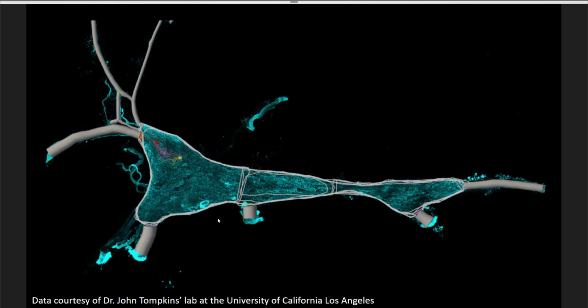In this example of a segmentation, morphological and physiological data can be registered to a generic organ scaffold using the detailed fiducial markings. However, it is not complete until these fiducial structures segmented in the stellate ganglion are named using FAIR ontologies from the SciCrunch database. With these FAIR terminologies embedded into the data file, it is easy for researchers to communicate the relevant anatomies to the scaffold engineers and ensure appropriate registration of the segmentations to the 3D structure models.